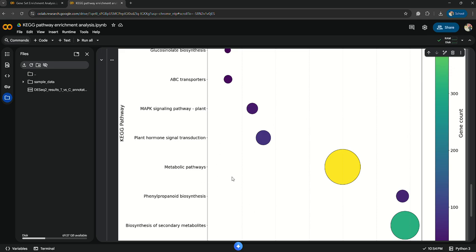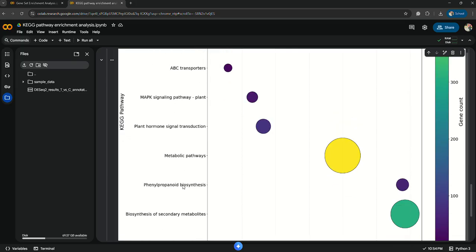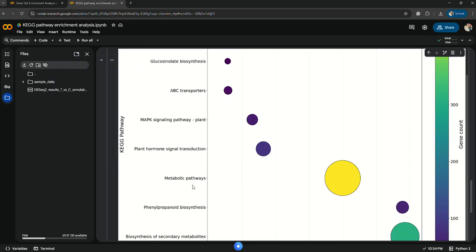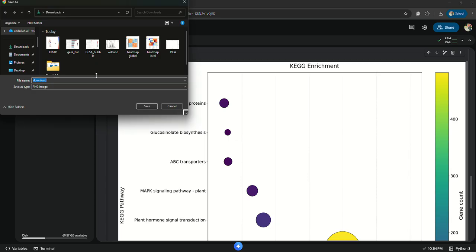This is a very vague name, but basically this. You can save it.